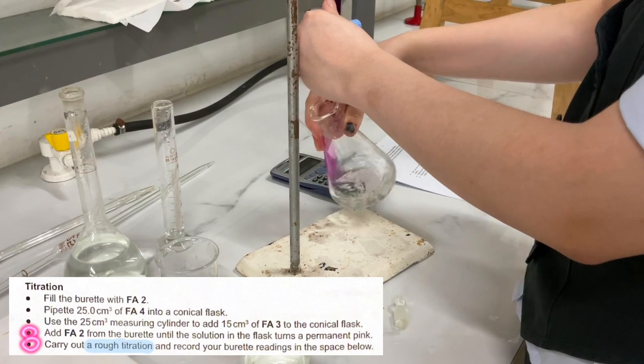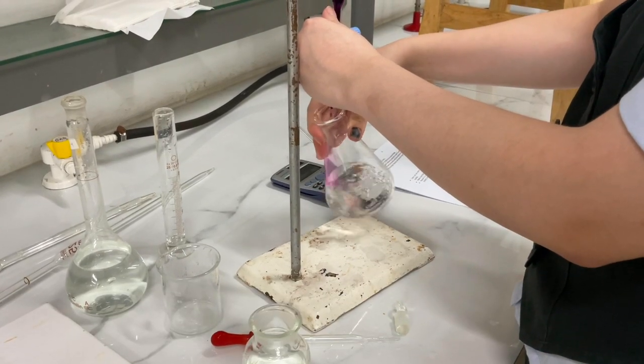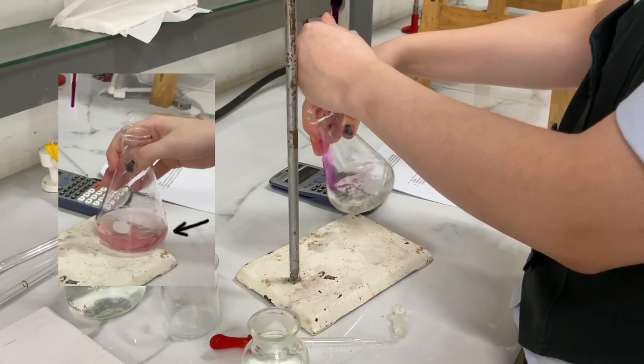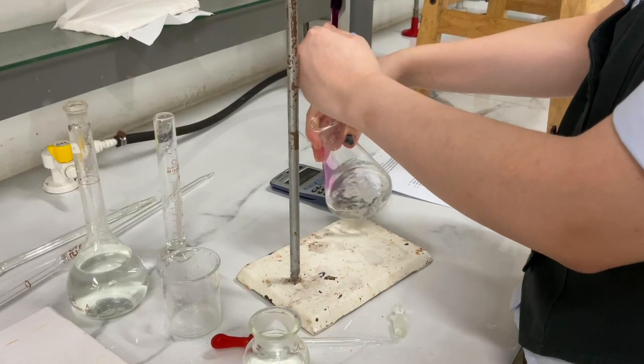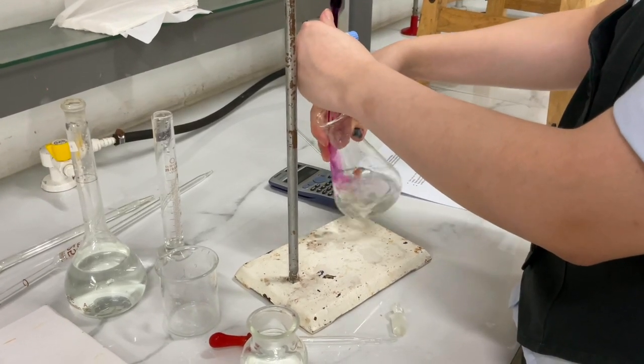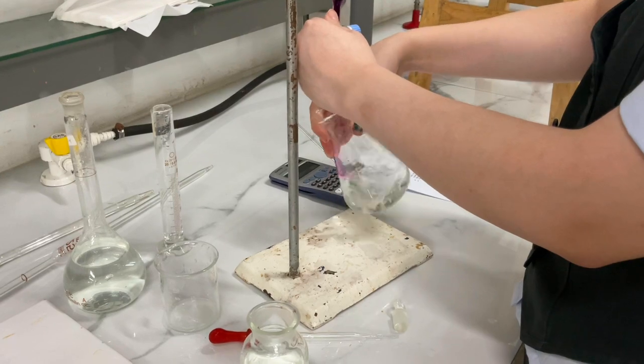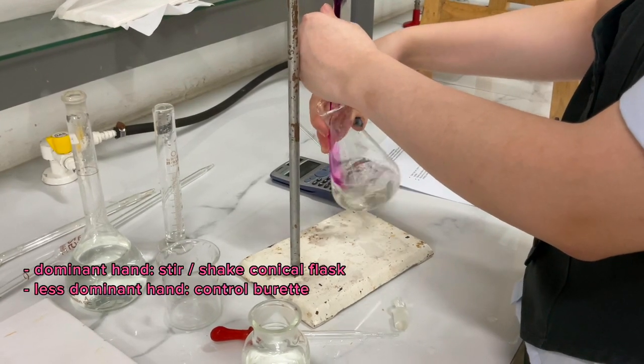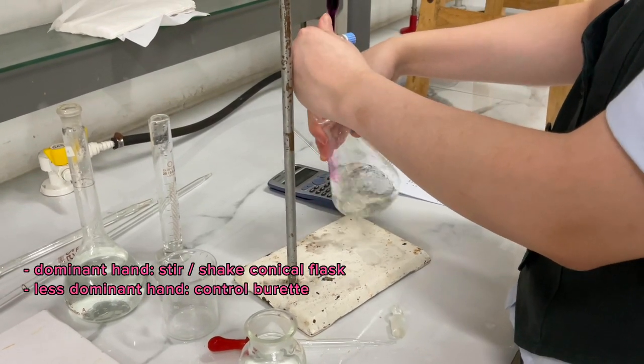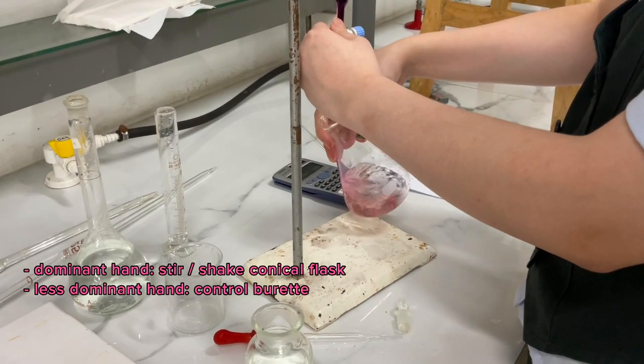Now, for the rough titer, add FA2 from the burette until the solution in the flask turns into a permanent pink. Do not do this drop by drop. Instead, let FA2 flow until color change is seen. This can be done with your dominant hand used to stir or shake the conical flask and your less dominant hand for controlling the burette.